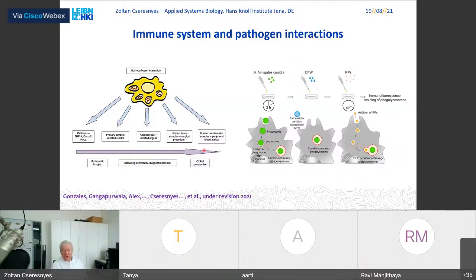What we concretely will talk about today is the experiment that's pointed out here, a simple chart from one of our manuscripts currently in work, where the immune cells, in this case the macrophages, are plated, for example, in a petri dish. And then once they are plated out and rested after the deposition, fungi are added to this environment. For example, Aspergillus fumigatus, which is a main focus of our institute, all the way to yeasts and other fungal species. Most of the data that you will see today as a demonstration of our methods will be coming from the Aspergillus fumigatus fungal strain.